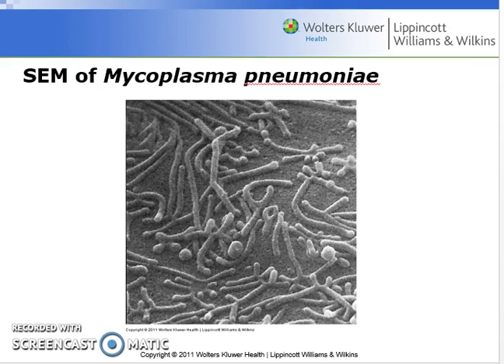And here's Mycoplasma pneumoniae, which you can see here on this slide. Here's the pleomorphic nature, where you have these round shapes and then these long broad shapes on the same slide. In most bacterial specimens, you wouldn't see that.